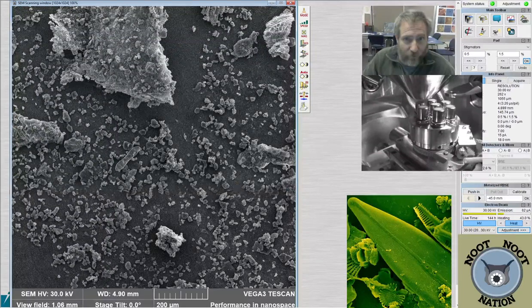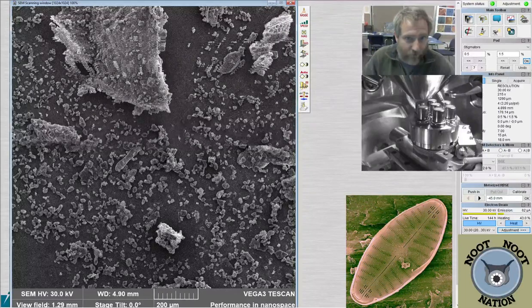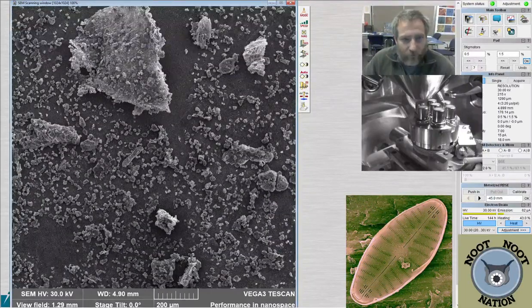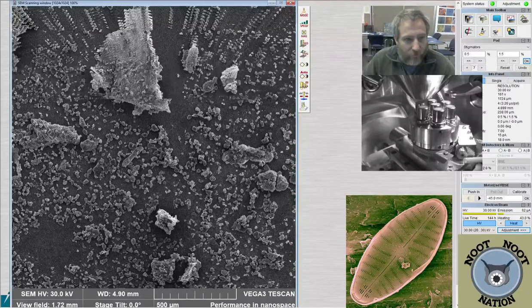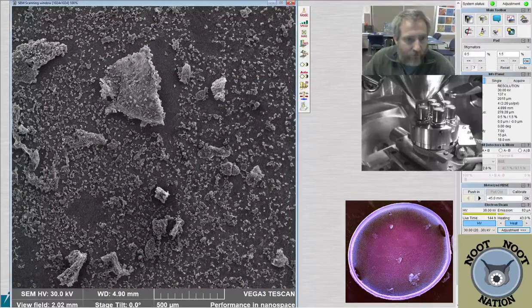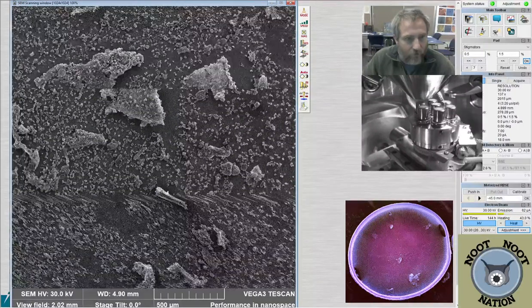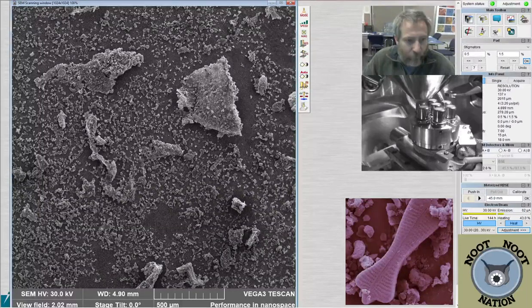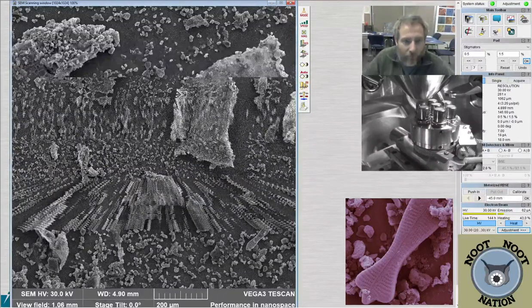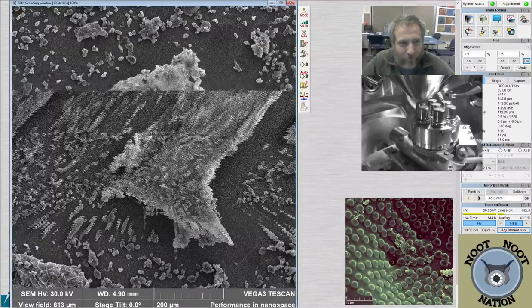We found this Discostella that didn't really belong in North America. When I figured out the species, it was actually supposed to be in Asia. I was confused by that, and we talked about it with another colleague who also found some in Arkansas. Together, we decided this was something we should consider publishing. So we started looking at it and trying to figure out what its distribution was in North America and why nobody had observed it before. And we think it's an invasive species. That's the short version of it. The long version you could read in the paper that was published today if you're interested.